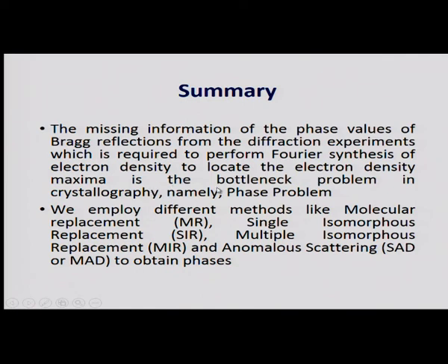So, this bottleneck, namely the non availability of the phases to compute Fourier synthesis in order to locate atomic site, is known as the phase problem.